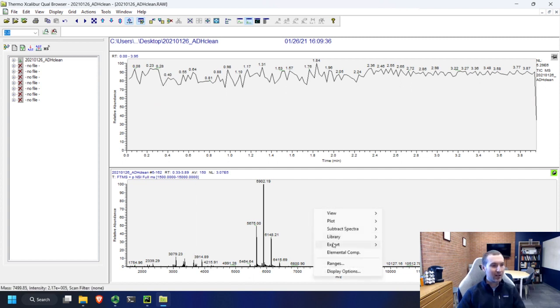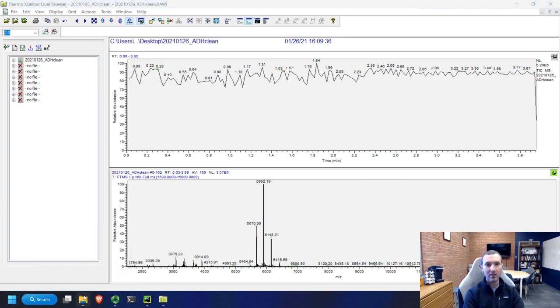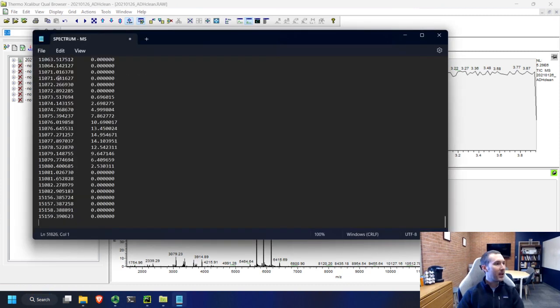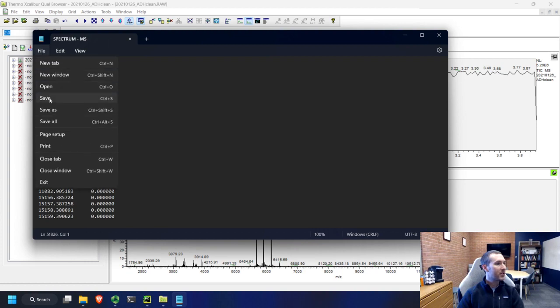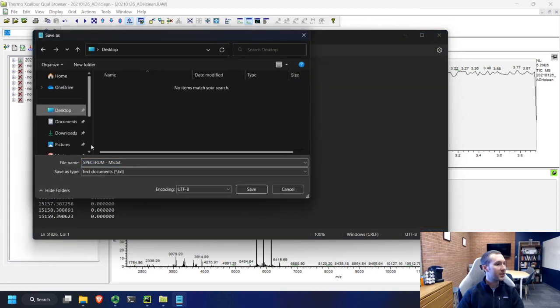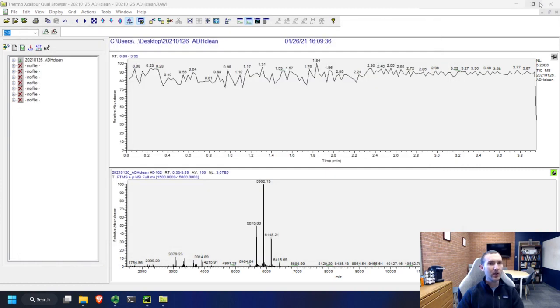But today we're just going to do something very basic. We're going to right click, export it and copy it to the clipboard. We're going to open up notepad and paste in our spectrum. We're going to save it, just put it on the desktop.